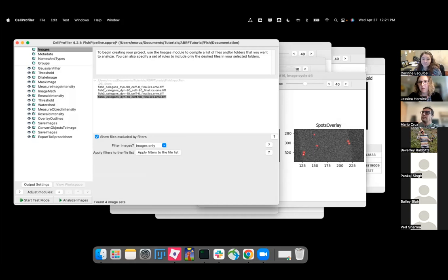So I have a question. I've used CellProfiler just very briefly in the past, and for batch processing large data sets, it asks to export to a database instead of export to a spreadsheet. But honestly, I had no idea where to even open the database after it had been created. So can you talk about the differences between those two?